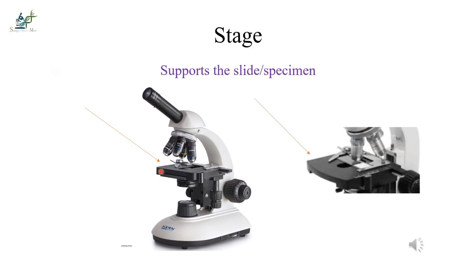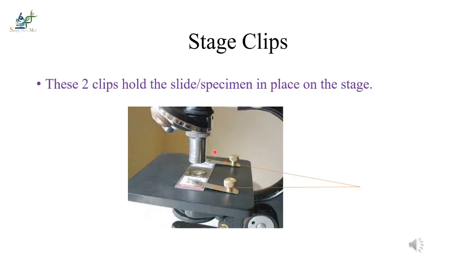And this is the stage. The stage will support the slide. And here on the stage, we keep the specimen. Stage clip. These two stage clips hold the slide or specimen in place on the stage. Simply, the stage clip will hold the slide.